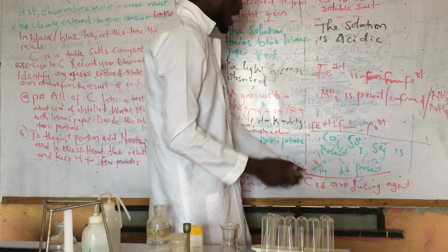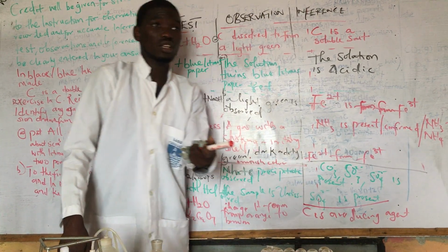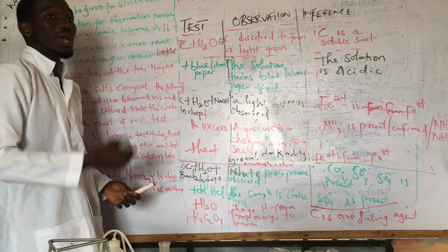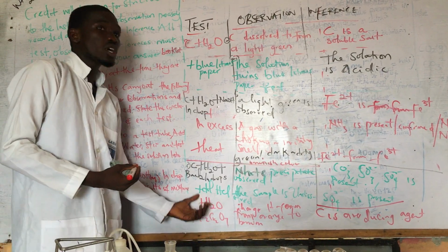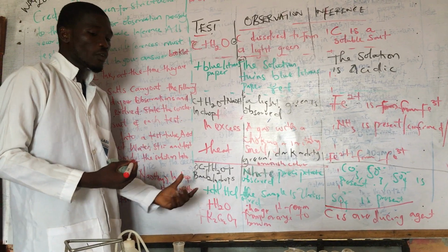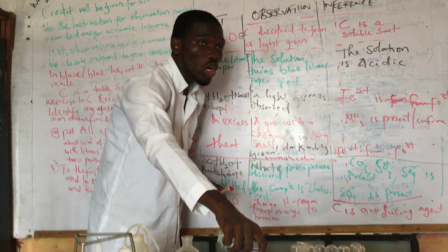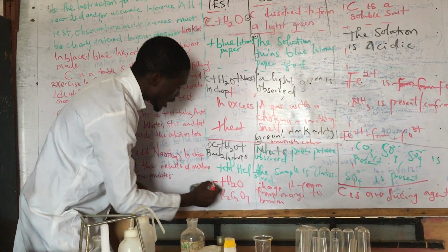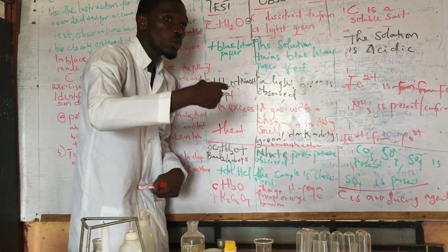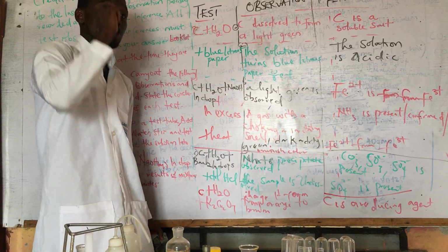So guys, the last one I stated here, it is not given, but in case on the examination day, you are asked to test for the sample C plus water with potassium dichromate, don't forget, the color of potassium dichromate is orange. So it will change its color when you add it to sample C plus water from orange to what? Brown. Telling you guys that what? C is a good reducing agent.